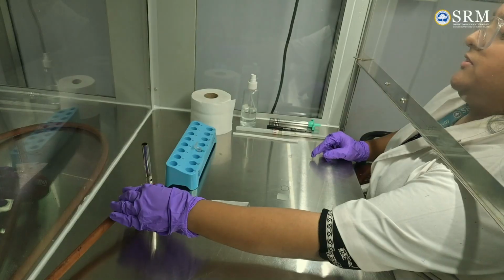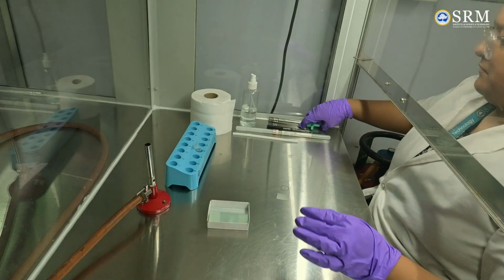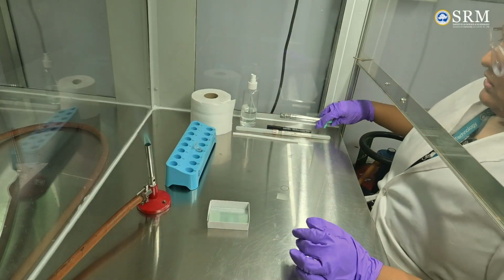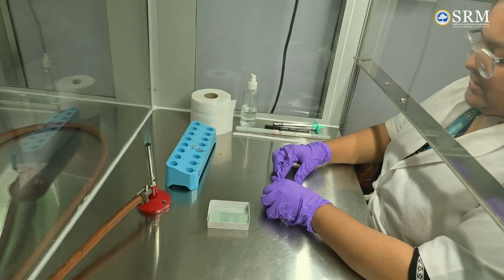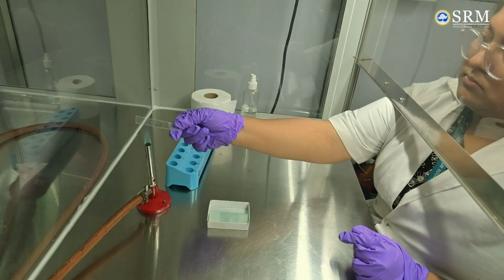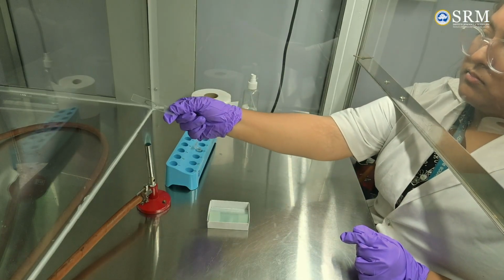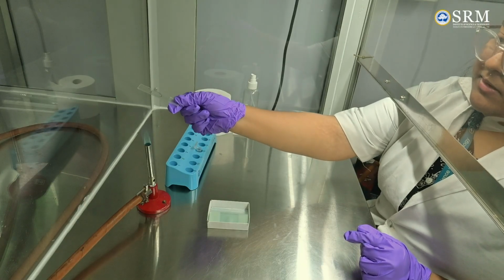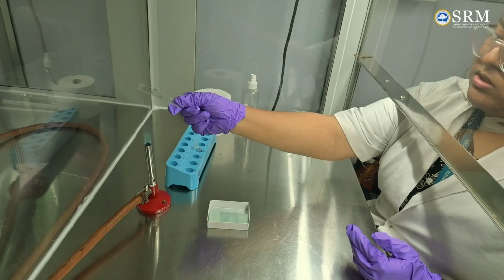We turn on the gas flame. And we now need to heat fix this slide. We normally do it from the upper side of the flame and on the bottom portion of the slide.